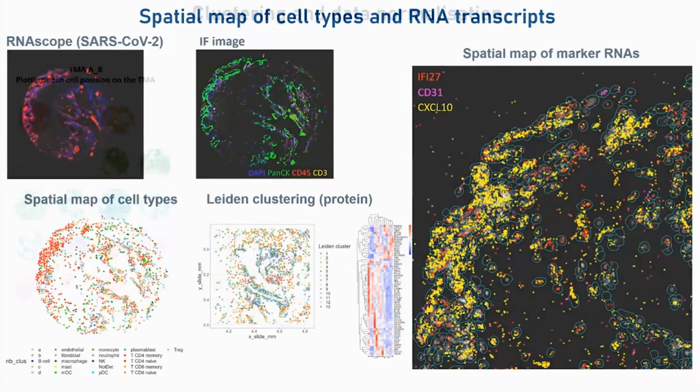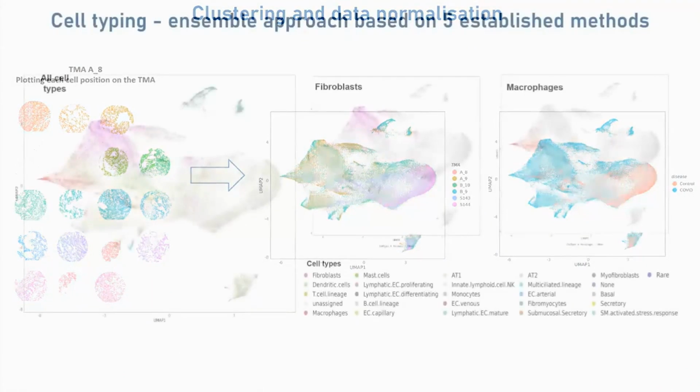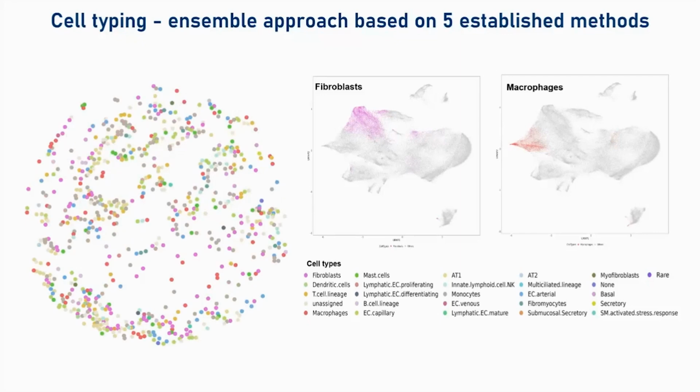And so we can take these and map these back onto the tissues and do some data normalization on this, and we can start to look at the individual cell types. So we can start to look at the fibroblasts and macrophages and so on when we project this onto a UMAP. And then we can start to compare between viral high and viral low, or COVID versus normal, what that signal looks like on the tissue. So this is just mapping those cell types back onto the tissue.